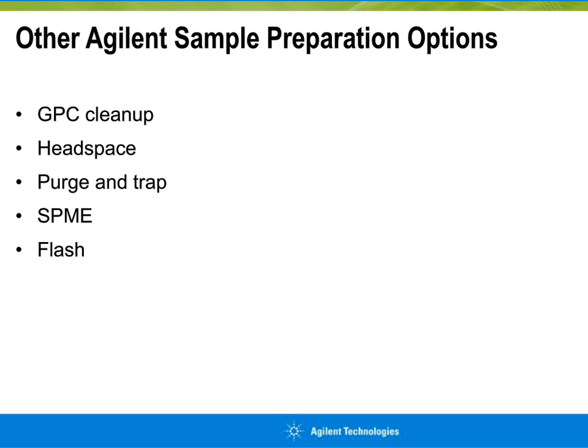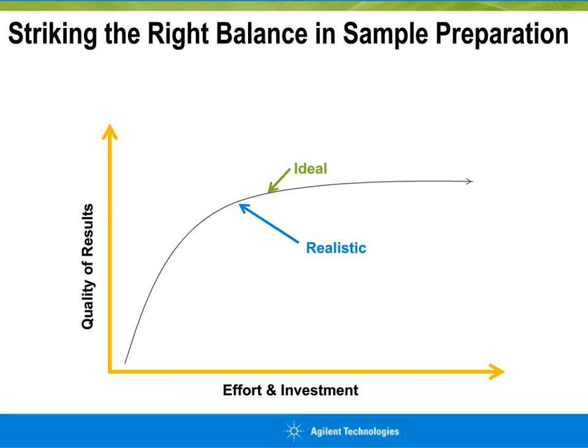So therefore, with the numerous sample preparation techniques that we have quickly presented to you here, it is possible to strike a balance between effort and investment and quality of results based on your application requirements with the correct sample preparation technique.